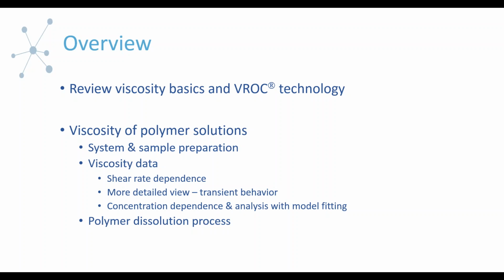And just a quick overview of what we're going to cover. We're going to review the viscosity basics, because that's important in this case, and then the VROC technology, which is the core technology of our instrumentation. And then we're going to get into the bulk of the discussion, which is going to be looking at polymer solutions, viscosity measurements of polymer solutions.